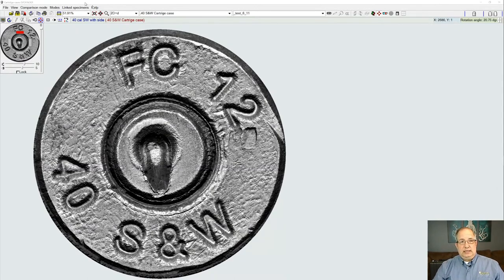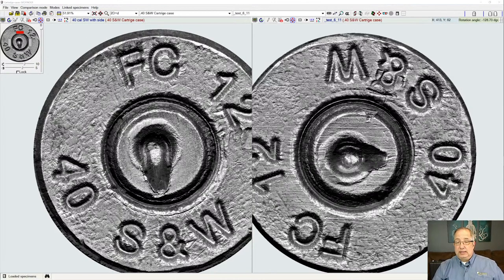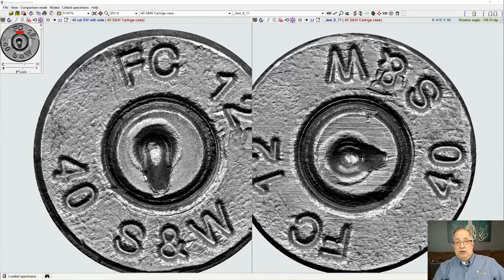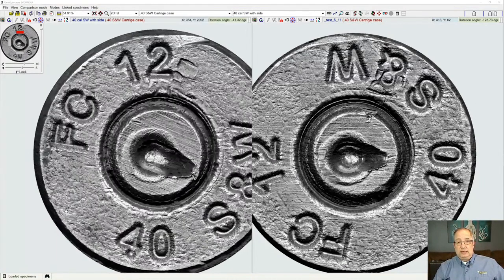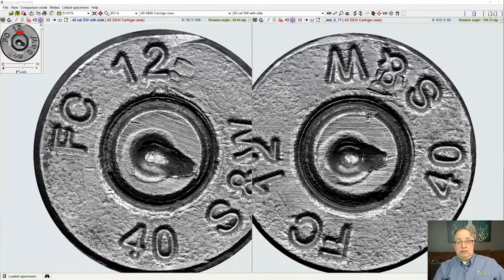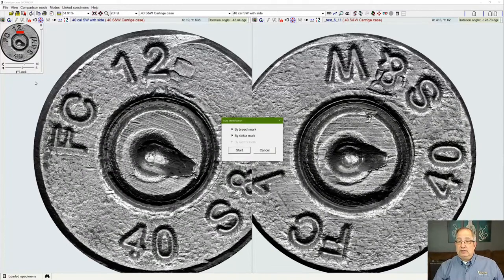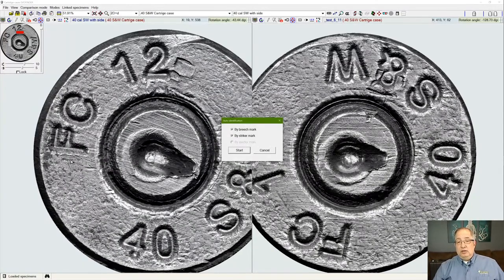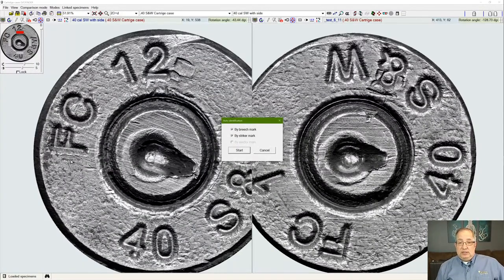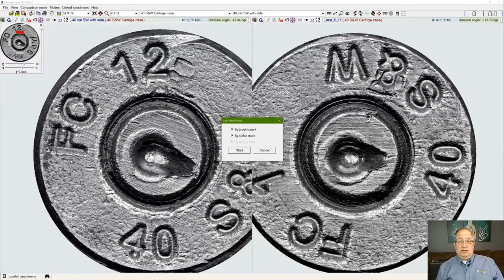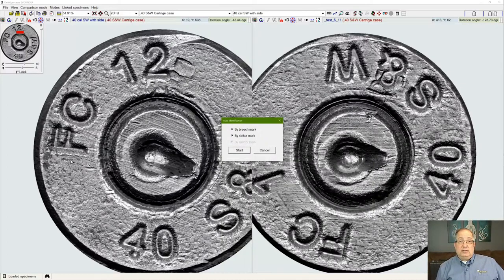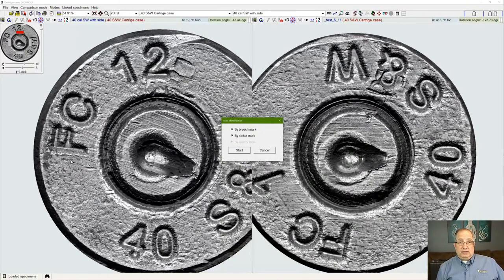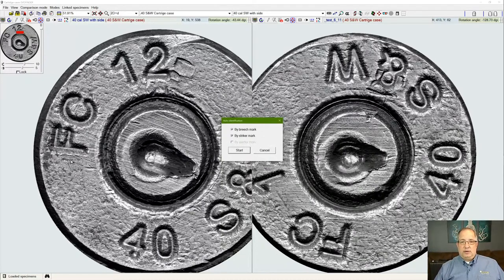Moving on from here, we also have the ability to do auto-identification of samples within the database. If we have a sample under test or examination, we can use this sample and run it against other samples within the database. With this function, using cartridge cases, we can search by our breech face impression, our firing pin impression, or our ejector marks for the auto-identification function. In the case of bullets, we can use land engraved areas, grooves, or slippage marks for the auto-identification process itself.